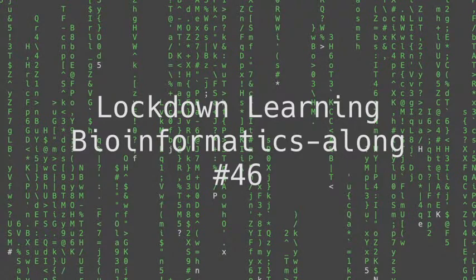And so consequently, as we saw last time when we looked in a little bit of detail at the SAM specification, that SAM file contains all of the data that's in the FASTQ as well as some other data besides. Because at the moment it's text on the disk, it occupies quite a lot of space.